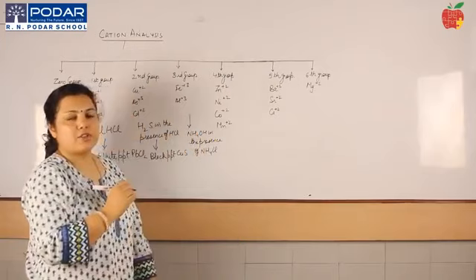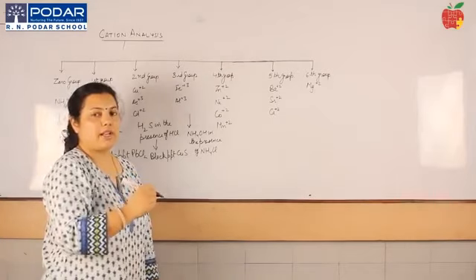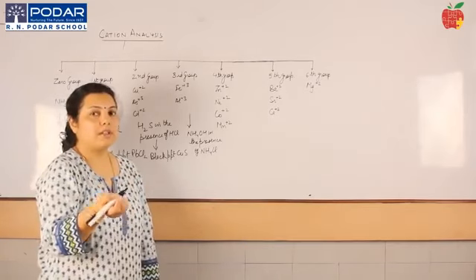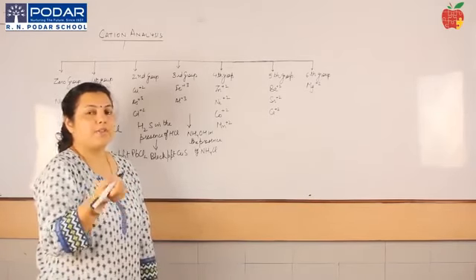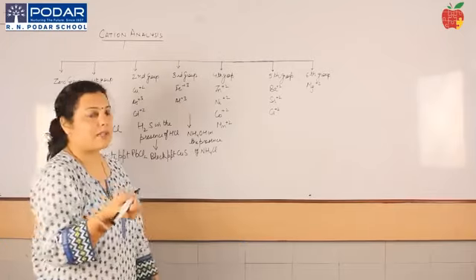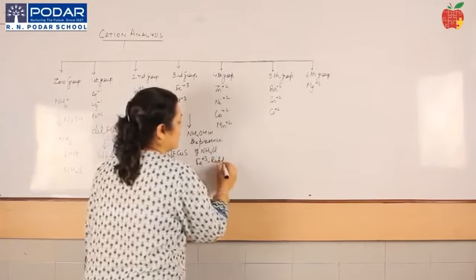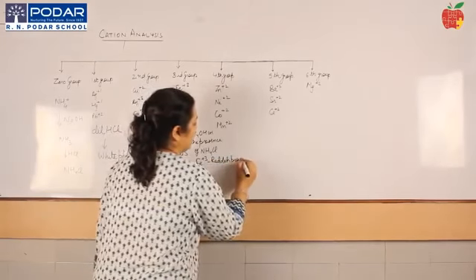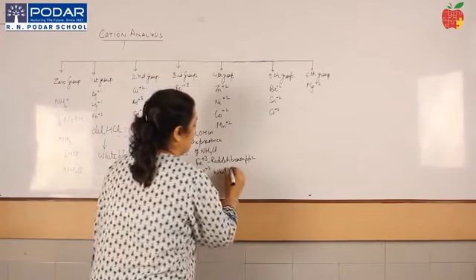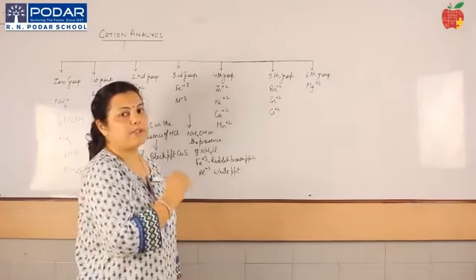So you will take your salt solution, add solid ammonium chloride to it, and ensure that the ammonium chloride gets dissolved. How do you test that enough ammonium chloride is present? The test tube should smell of ammonia. When you dissolve ammonium chloride and the test tube smells of ammonia, after that we add ammonium hydroxide. In the case of ferric, you will have a reddish brown PPT. In the case of aluminium, you'll have a white gelatinous PPT. If you have these two observations, then you can carry out their confirmatory tests to confirm the presence of these cations.